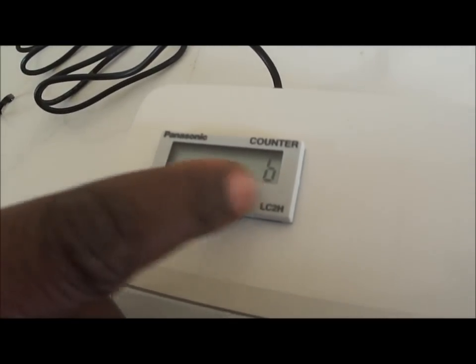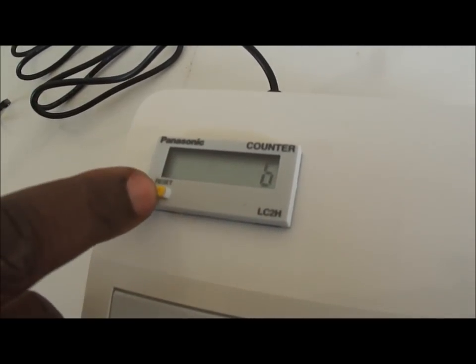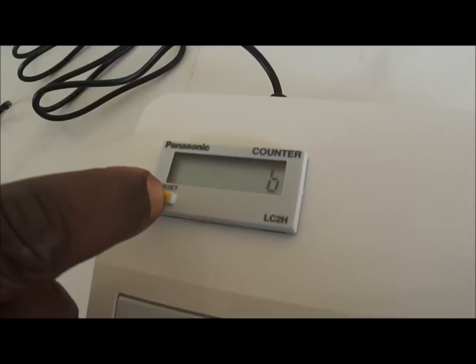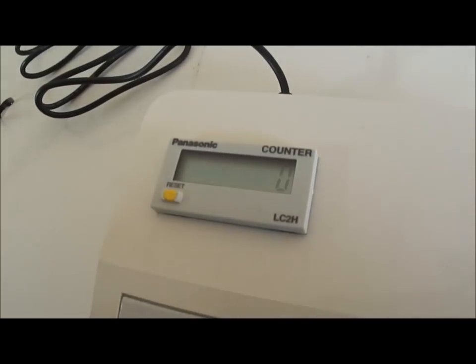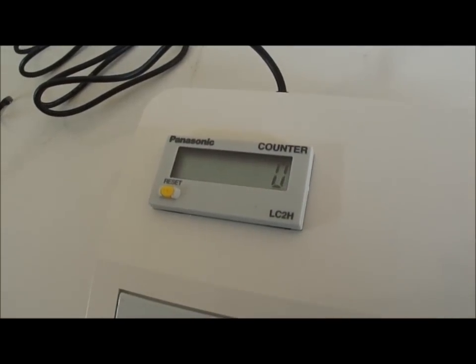For example the number here is six, if I want to put it to zero, I press the reset and then it's zero.